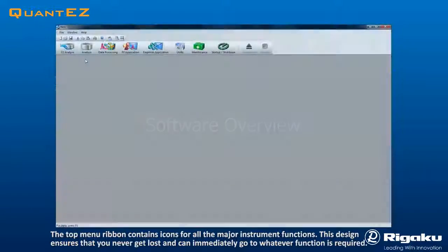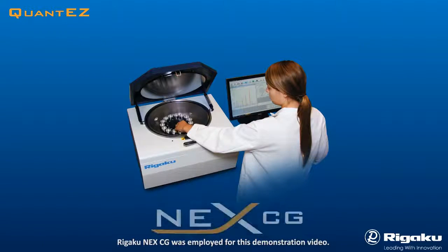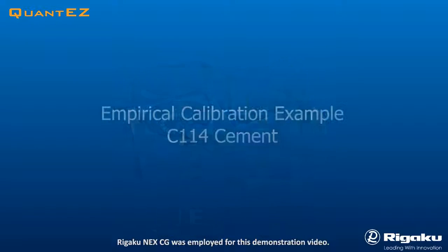The top menu ribbon contains icons for all the major instrument functions. This design ensures that you will never get lost and can immediately go to whatever function is required. Rigaku NEX CG was employed for this demonstration video.